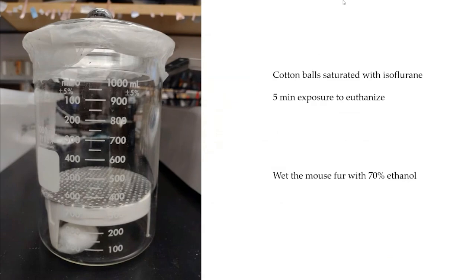So it's a dead mouse, and then you'll pull it out of the bell jar and spray it with 70% ethanol to wet the fur. Because when you do the dissection, if you've done mouse dissections, you don't want to have fur getting into your field when you open the animal. You don't want it getting into the tissue of the mouse.